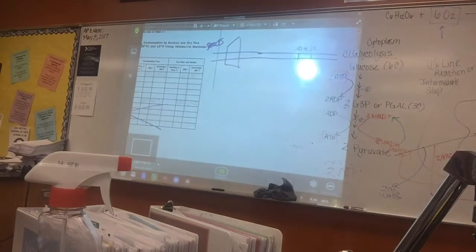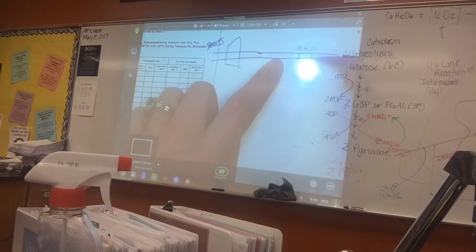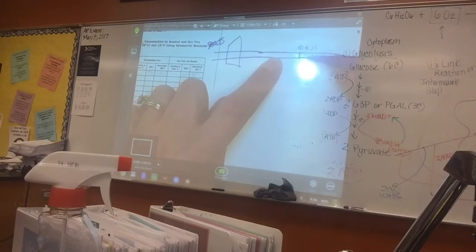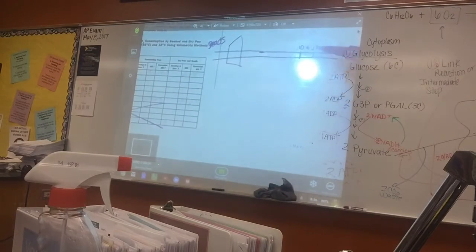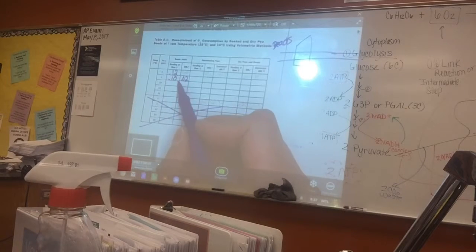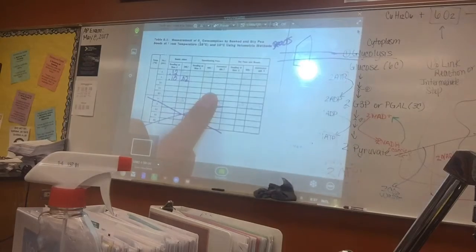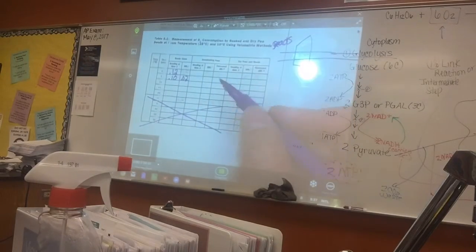So what's causing that? It could be a change in air pressure. Imagine I'm putting more pressure on the water. That's going to cause the water to move in, because the pressure in the water here will be greater than the air pressure inside the respirometer, and it'll move in. And so therefore, when we do this for the beads, and we look at for the time period how the beads changed, we have to correct that with each of our seeds.